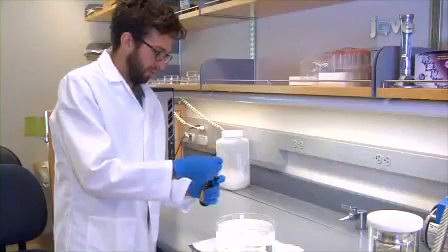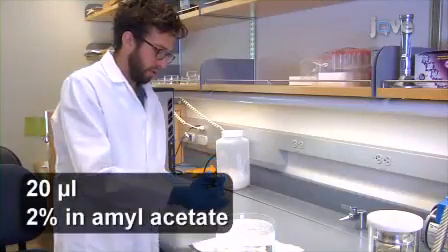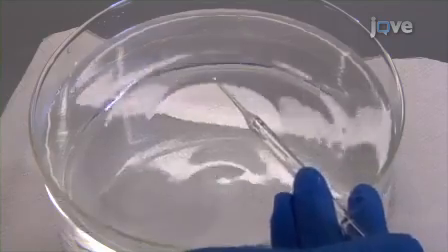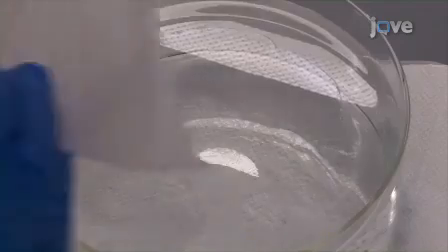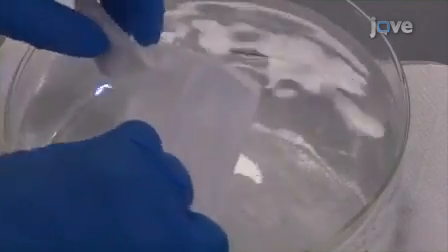Start by using a glass pipette to place a single drop of collodion into a large beaker of water, on the water's surface. As the collodion spreads, it may capture dust from the water's surface. Remove and replace a dusty film of collodion plastic with another drop.